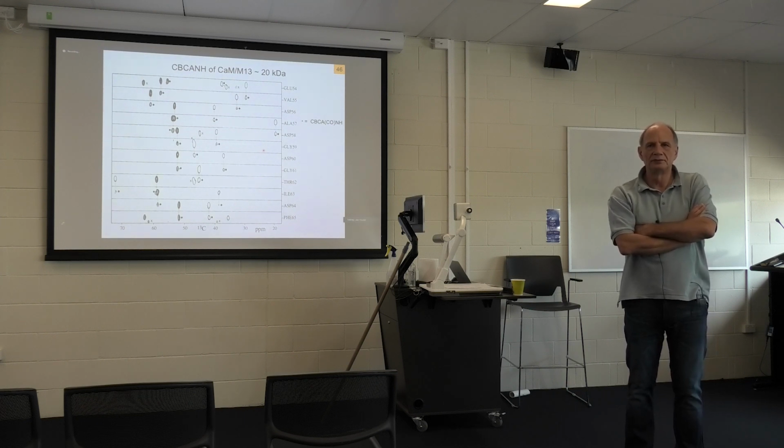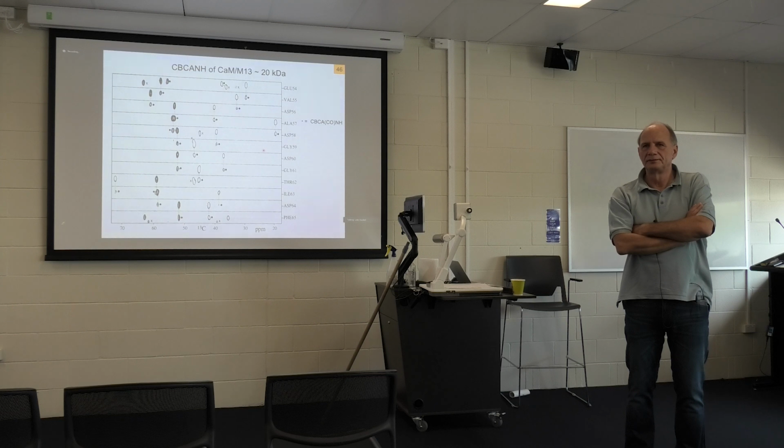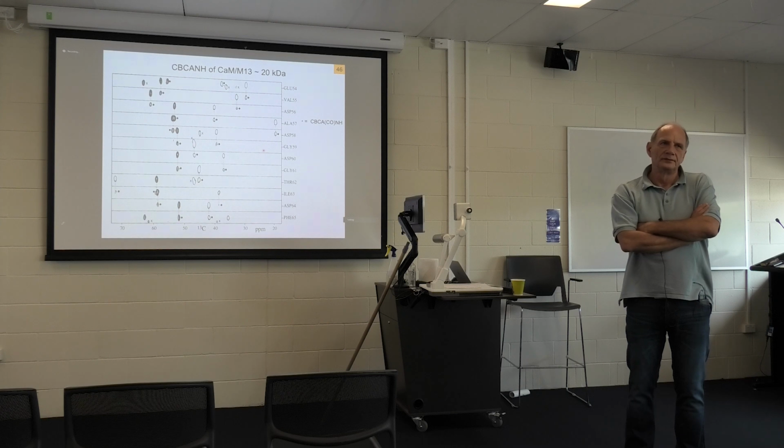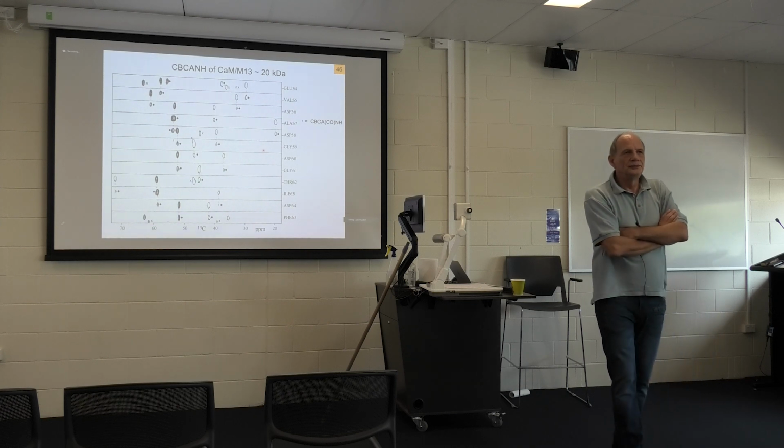Right. And also Bruker likes to use not square pulses but shaped pulses. Is that better? For carbon, yes, for all the C-alphas by default are G3 pulses, I think, and all the carbonyls also.